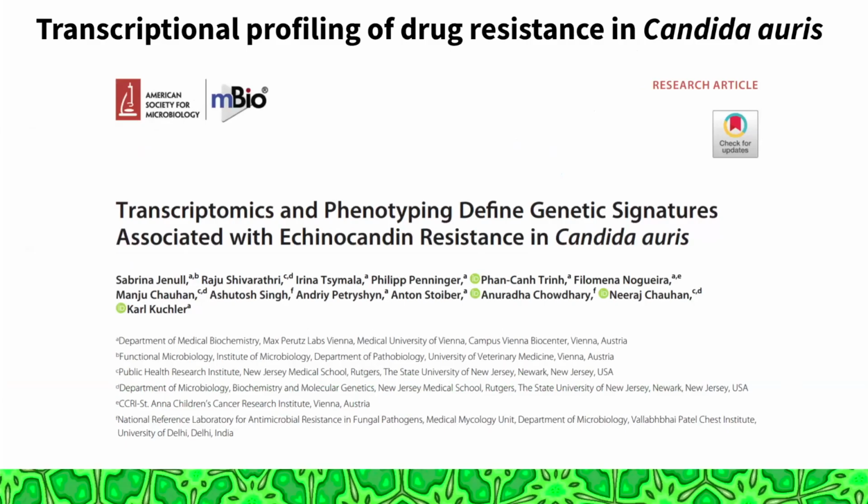So imagine the following scenario. So Anton, can I interrupt real quick? Somebody asked a very reasonable question looking at the list of workflows, saying, what's the use case for an assembly workflow, given that your entry point is an assembly? Excellent question. So right now, all the entry points on BRC are via a particular genome, but that's not going forward. There will be an entry point where you just want to do analysis and you want to do assembly, and you want to run analysis which are not hooked on a particular reference, such as assembly, for example.